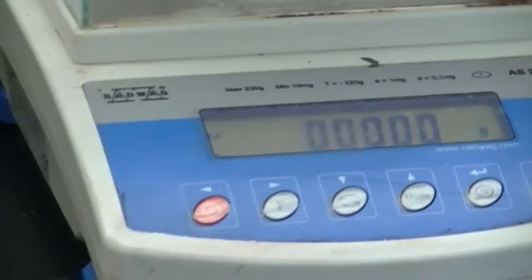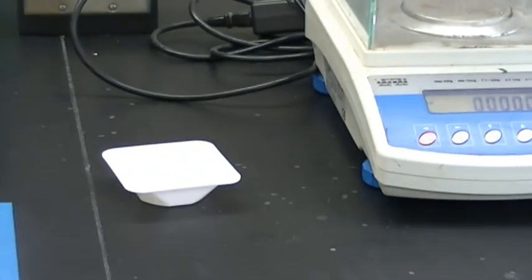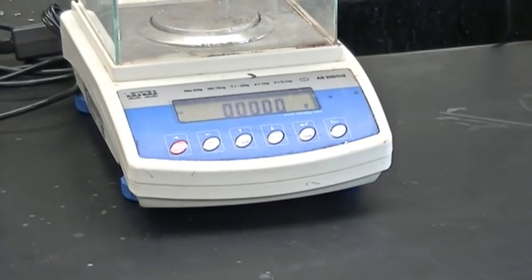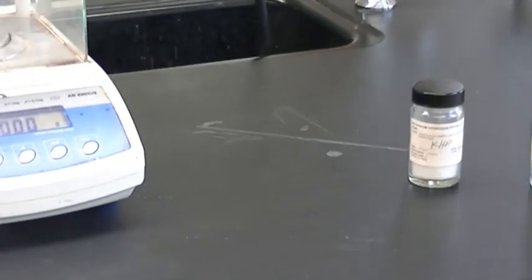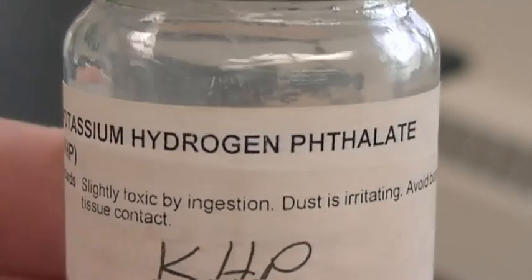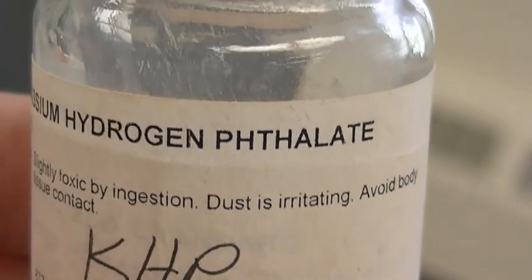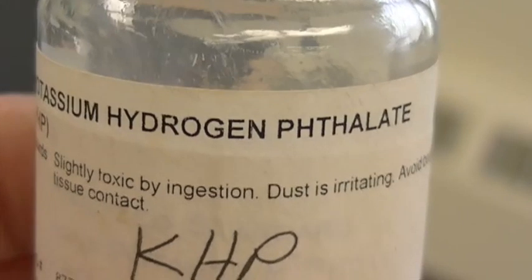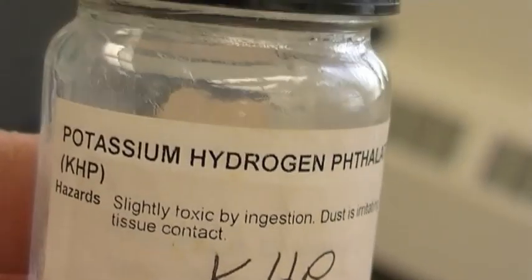All right, and so we have our 4 decimal place balance. We have our weigh boats, and we are going to add 0.17 to 0.18 grams of pure KHP. Now KHP is a compound called, can we see this here? There we go. Potassium hydrogen phthalate. So phthalate is an organic compound. You do not need to know the structure of potassium hydrogen phthalate. Feel free to look it up if you want.